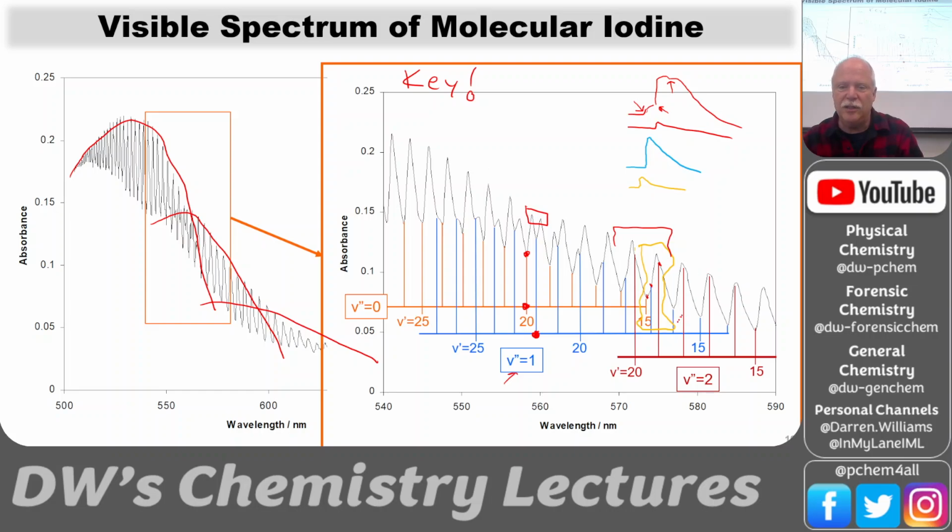And then it just goes to the twos and the ones. The zero is played out, and then we just have the two and the one. And again, notice up here, there's the funny little top of that peak, but the slope comes down again, and then it doesn't go down as steeply as possible. And then there's that peak, and here there's a tiny little double at the top, and so we're picking the middle of that little double piece.